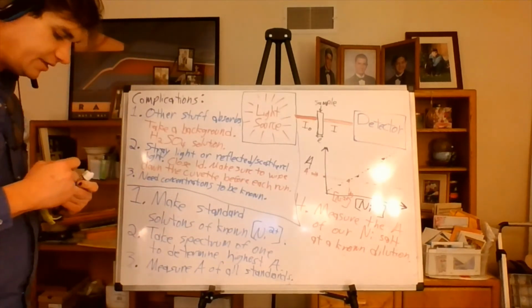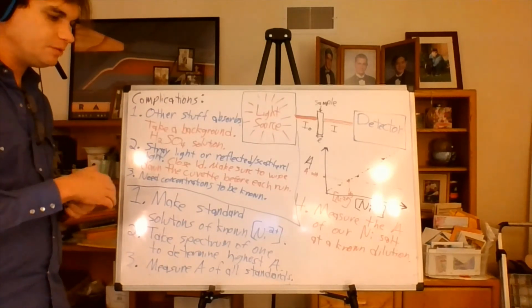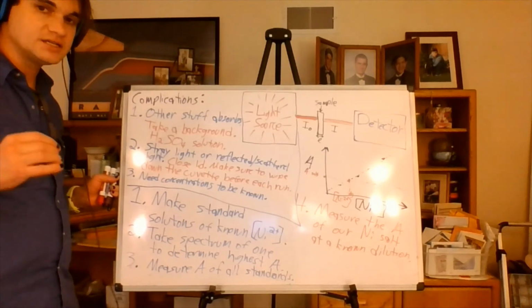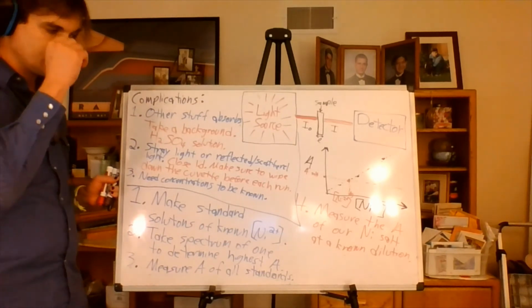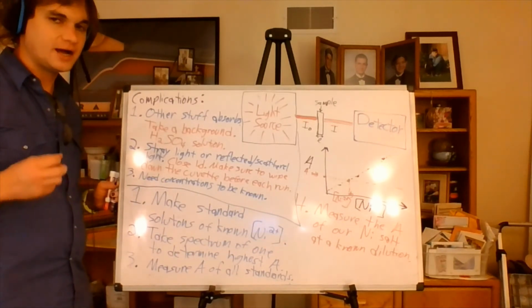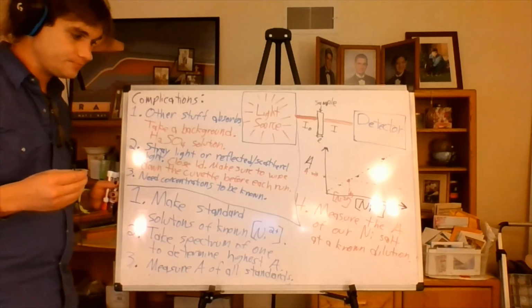And what I mean by this is we need to know that when we put a standard solution into the cuvette, the concentration of that solution is exactly what we think it is. And that when we put the test solution into the cuvette, we know exactly how much the salt was diluted by.